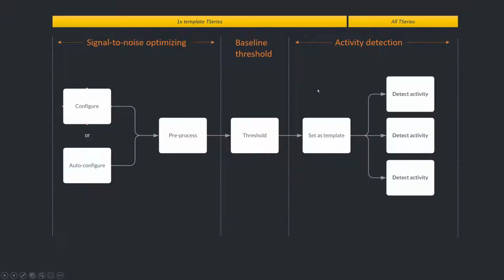And then finally, you have the processing step in which this is stored into the system as a region of activity mask, which will go into the actual output processing that we'll see later, and you'll get traces that you can analyze for activity.